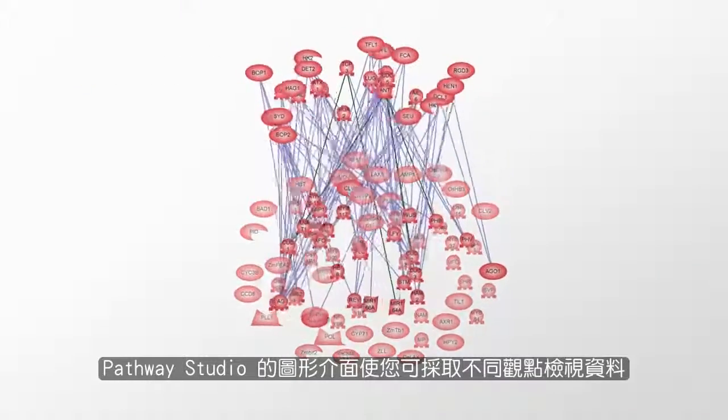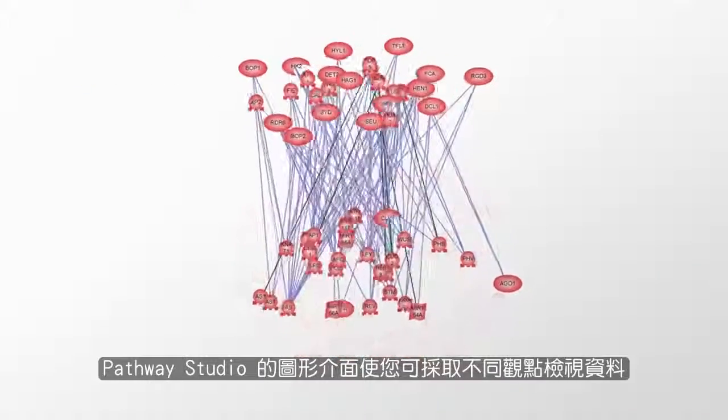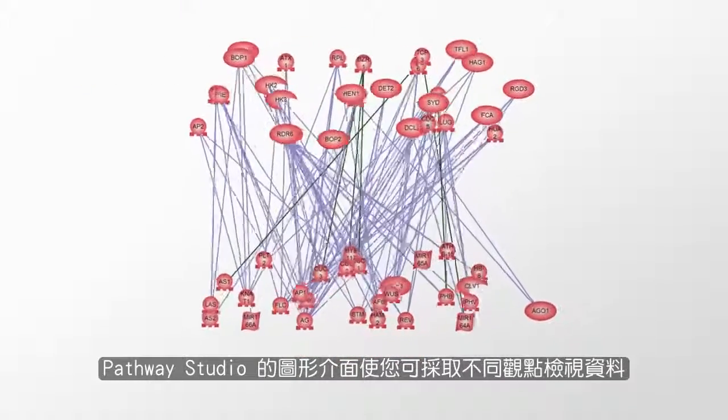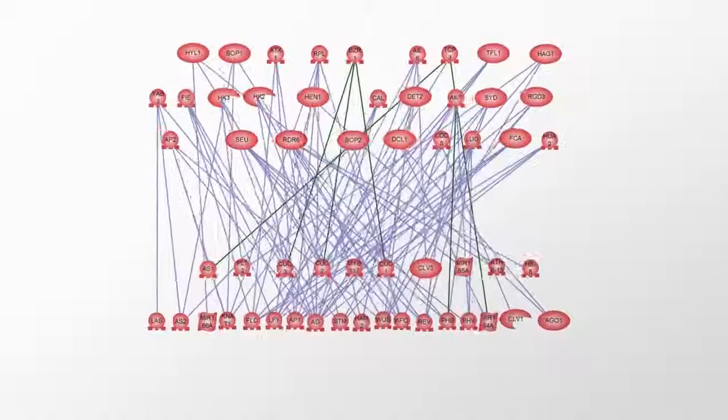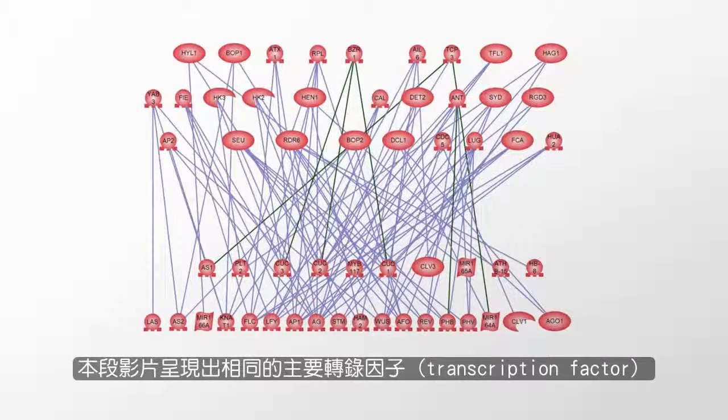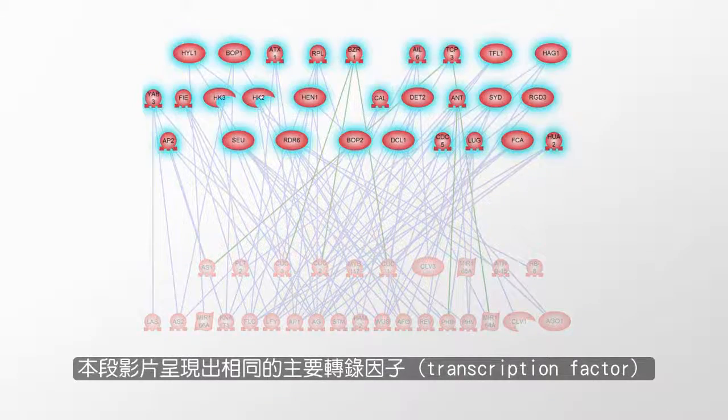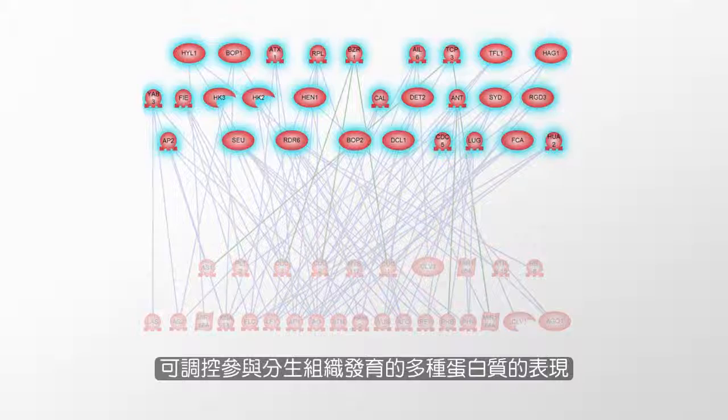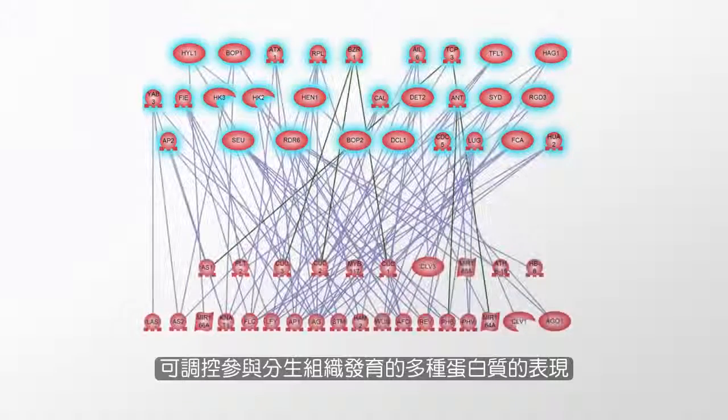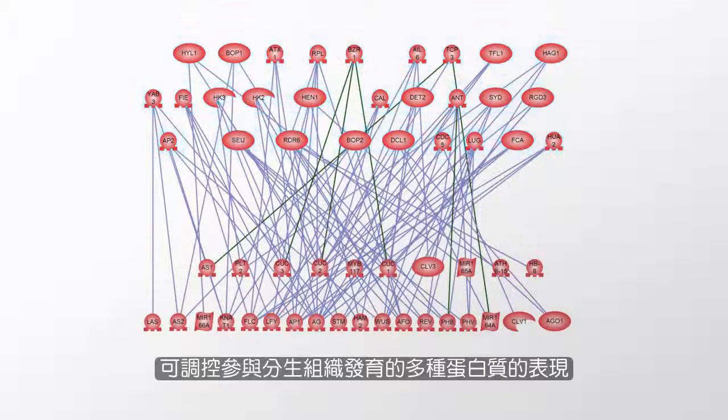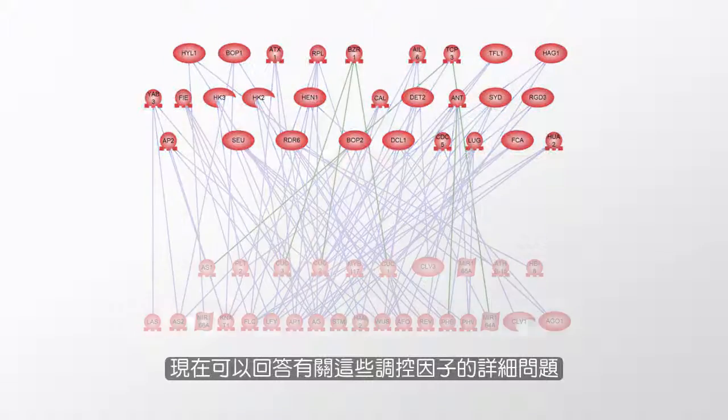Pathway Studio's graphic interface allows you to look at the data in different views. This is another view, showing the same major transcription factors that regulate expression of proteins involved with meristem development. Now, we can start asking more detailed questions about these regulators.